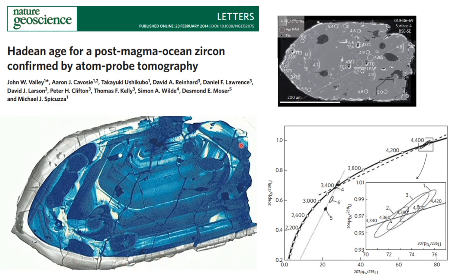So if we dissolved this whole thing and measured its uranium lead ratios, we would probably be able to calculate an age from that. But that age would be a mixture of all of the different ages of all of the different parts of this crystal that grew at different times. So what the authors have done here is use an ion microprobe, and they've measured different spots in different places of this crystal.